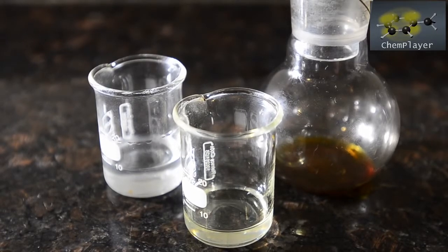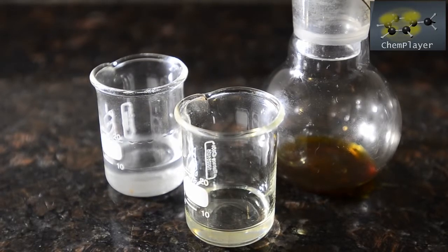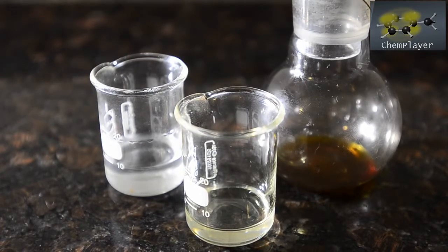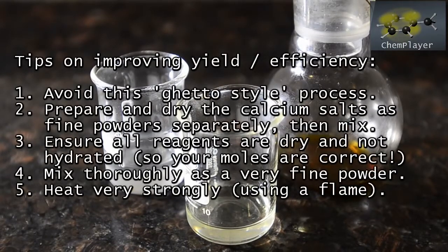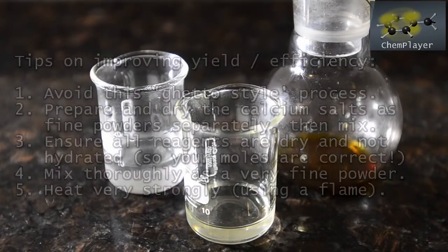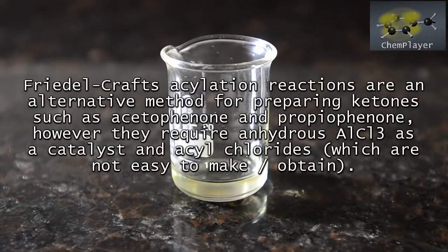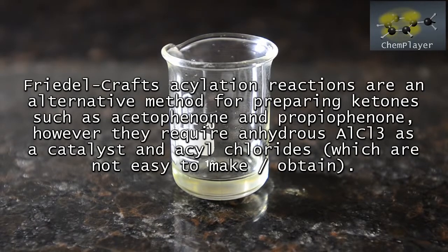We did this reaction previously in a different video using calcium propionate and calcium benzoate to make propiophenone, and got much better results. So here's our tips on doing this well. Prepare the reagents dry and mix them as fine powders first. Then use a lot of heat. It's still not an efficient method, but it's an option for preparing these compounds if you don't have access to the reagents needed for Friedel-Crafts type reactions, which is the normal route.